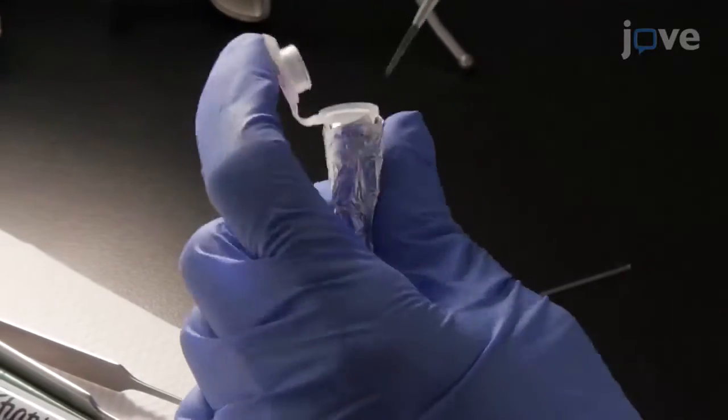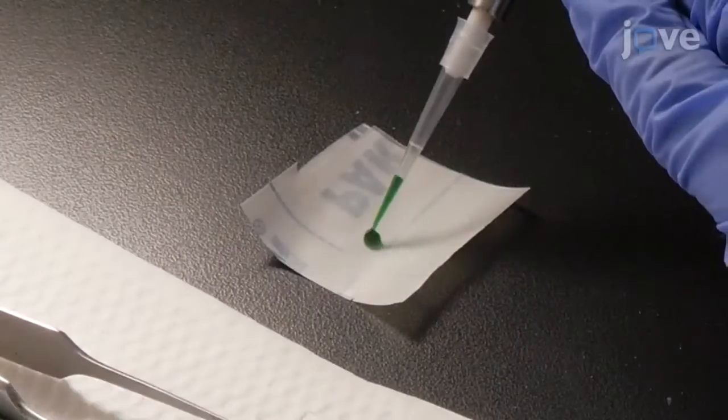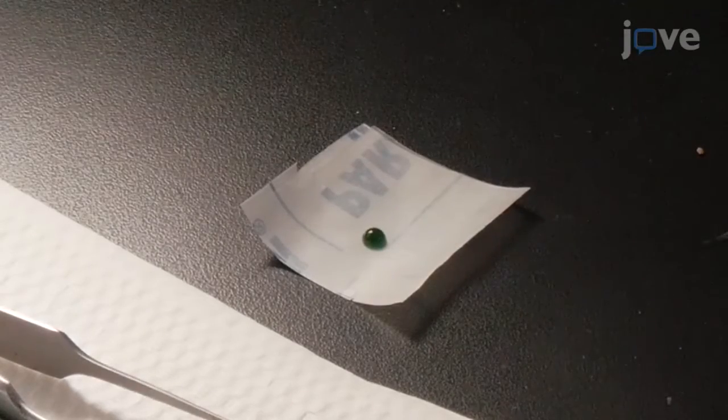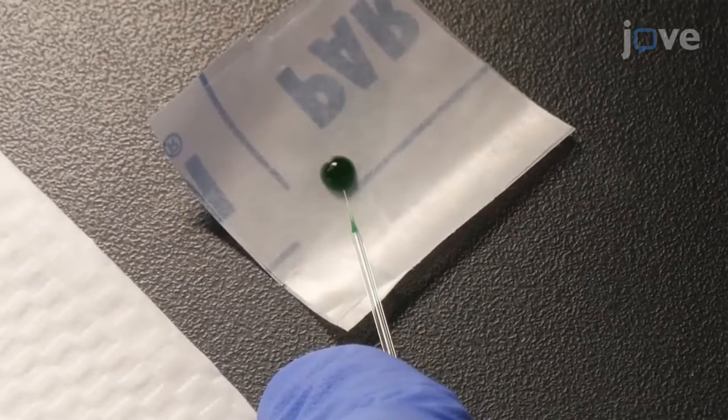Dispense 10 µL of 1.6 mg per mL particles onto a small square of parafilm, and pull the liquid into the needle.